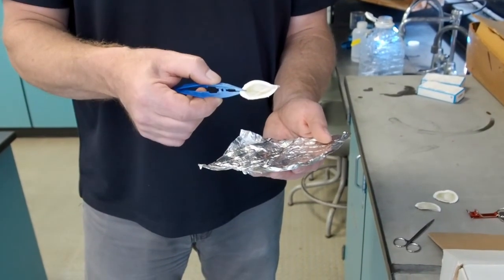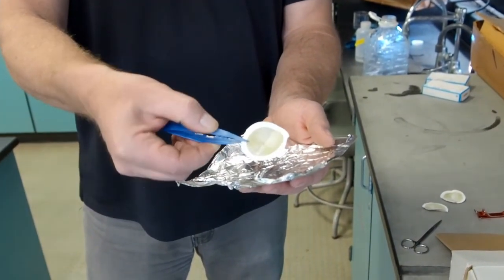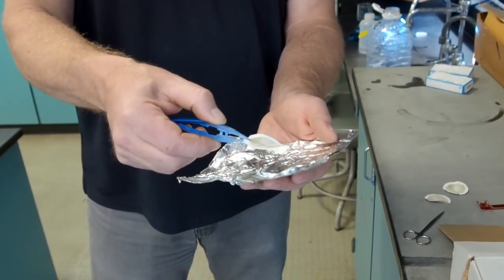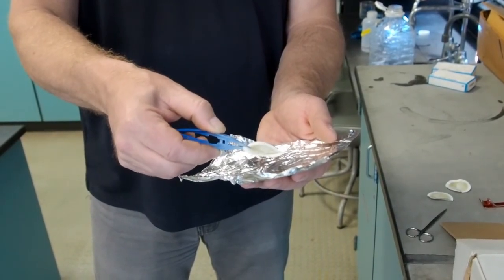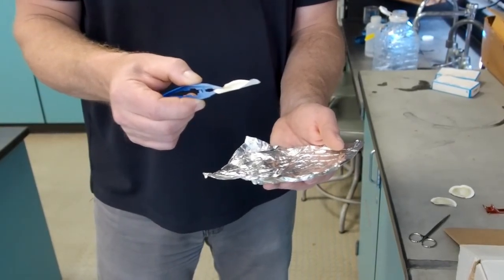Okay, so here's our finished filtered seawater. You can see the green and brown on the filter representing lots of algae, phytoplankton, as well as maybe some sediment. And these can be stored until they're ready to be processed for up to a month.